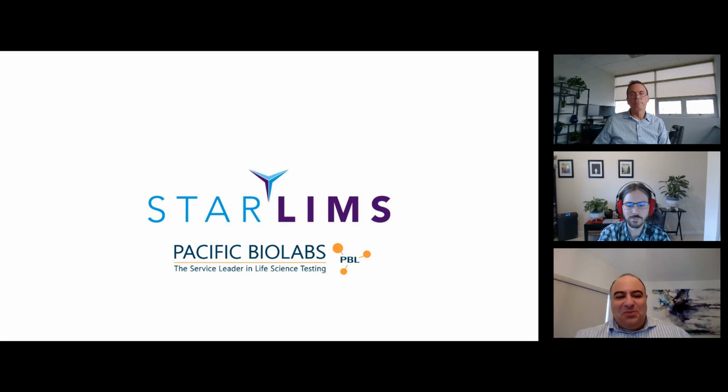But yes, the last point I wanted to make that Michael made was to make sure you validate the actual tool itself prior to use. That's critical.